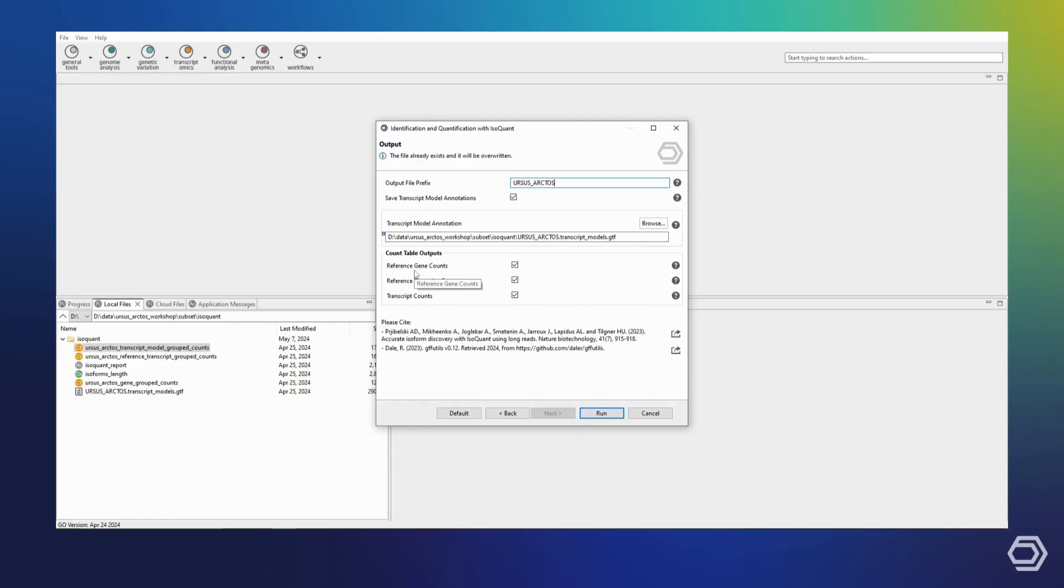While the first two options will include only those genes and isoforms already present in the provided reference, the latter option will include any discovered novel transcripts as well.